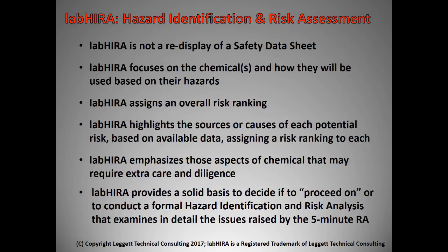So that gave you an overall view of labHIRA, and there are a few things to stress. labHIRA is not merely a redisplay of a safety data sheet. All of the information that you saw on the sheets for thionyl chloride and DMF is generated from the data held within labHIRA. labHIRA focuses on the chemicals and how they will be used based on their hazards. As you saw, it assigns an overall risk ranking.